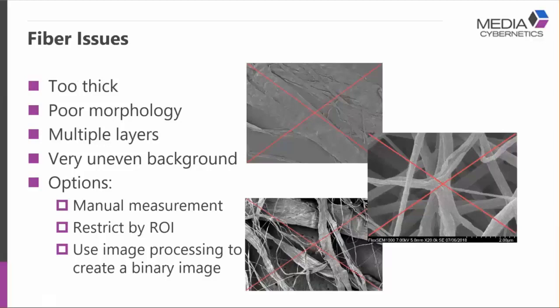And finally, using smart segmentation machine learning, you can use that or image processing to find your fibers. I mentioned earlier the slides of the typical protocol for doing smart segmentation: do a count size operation, and get a nice clean image where you have gotten rid of all the background, all non-specific materials you don't want to measure, and try to get well-defined fibers.